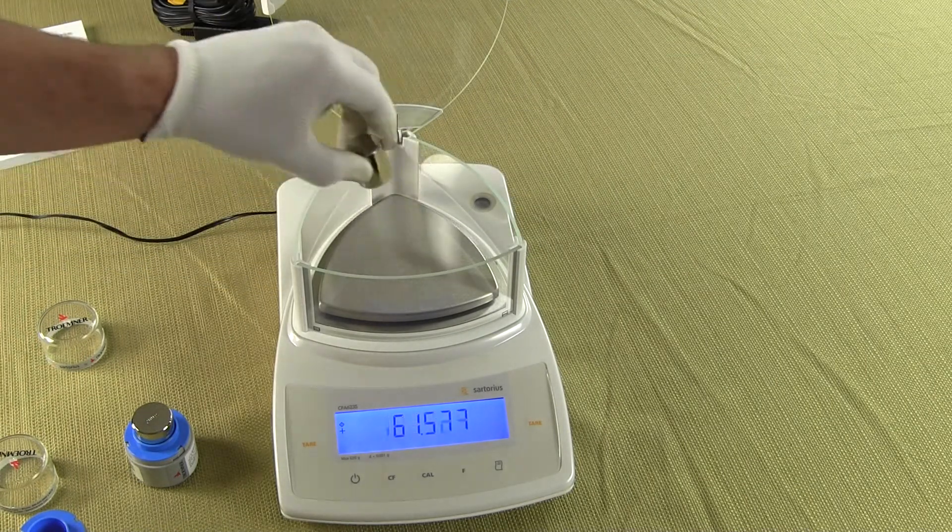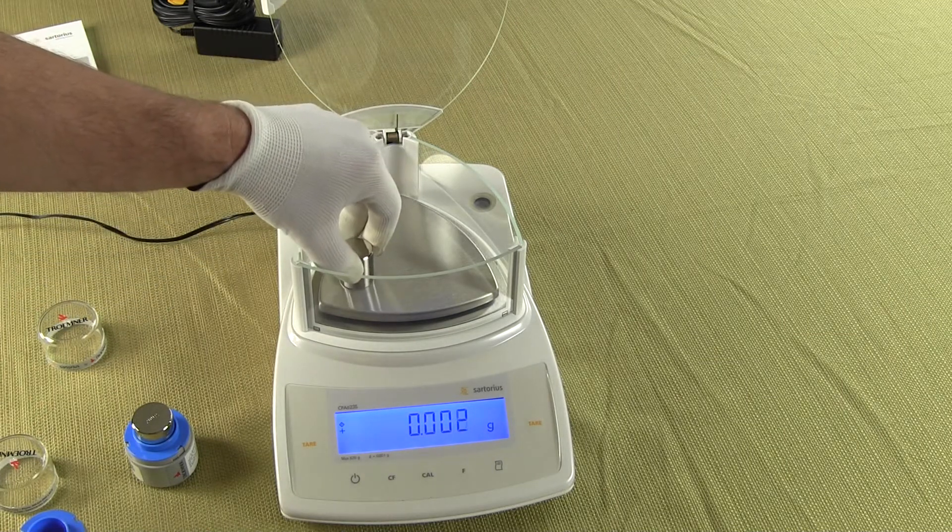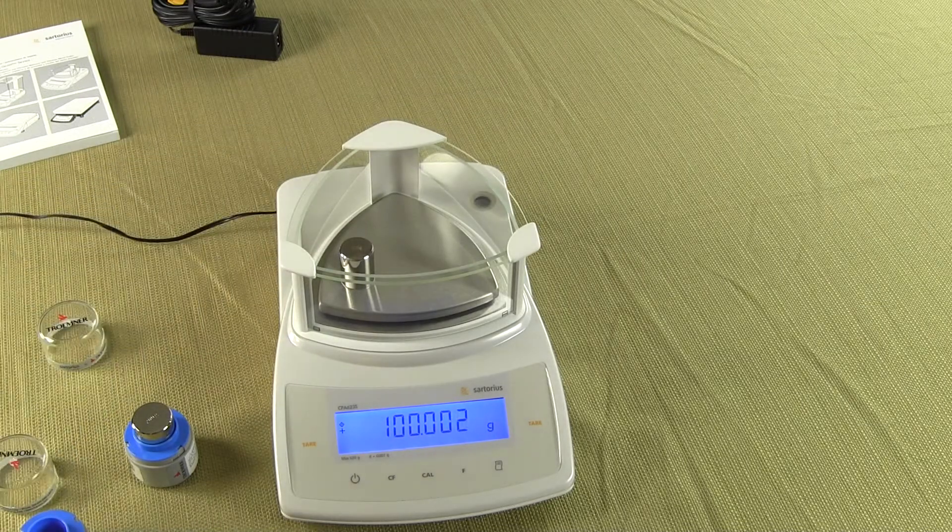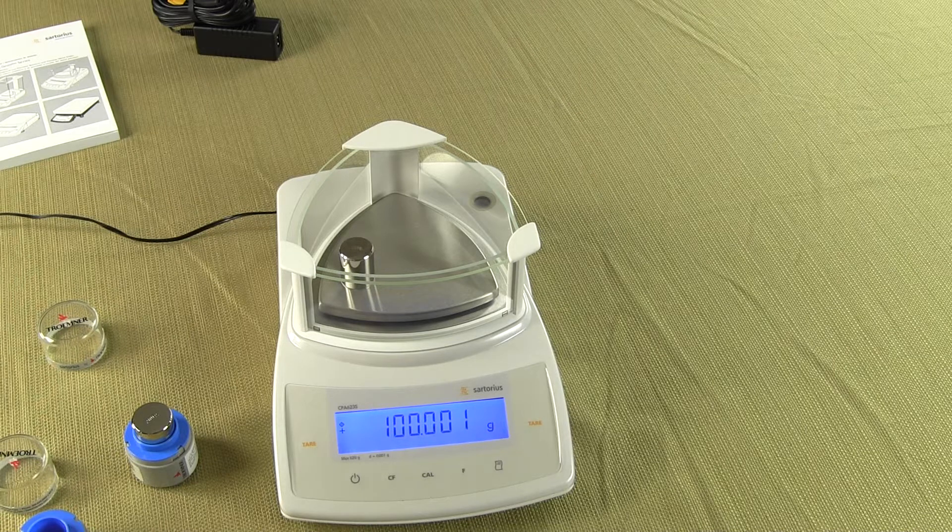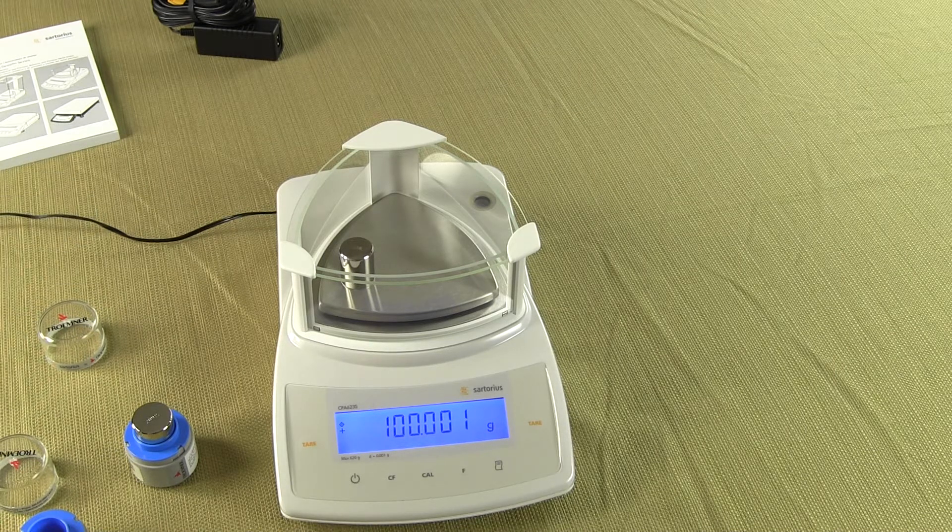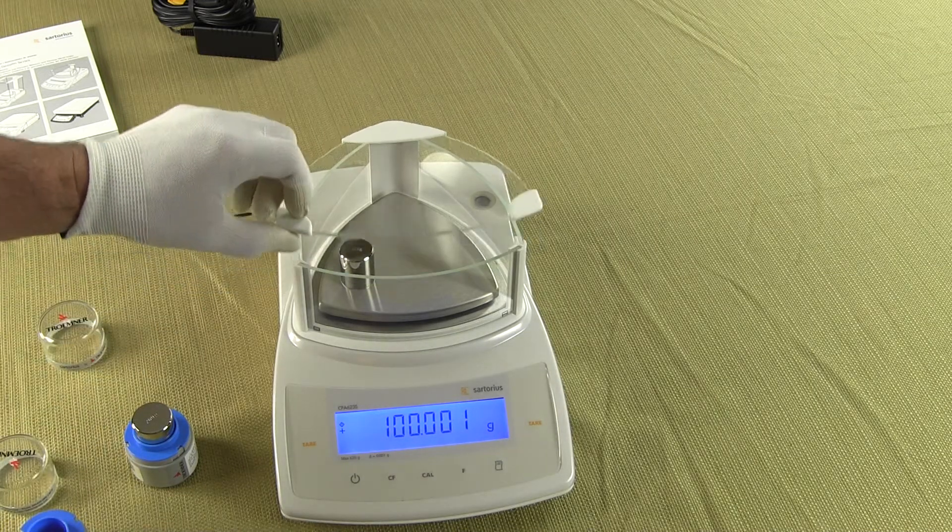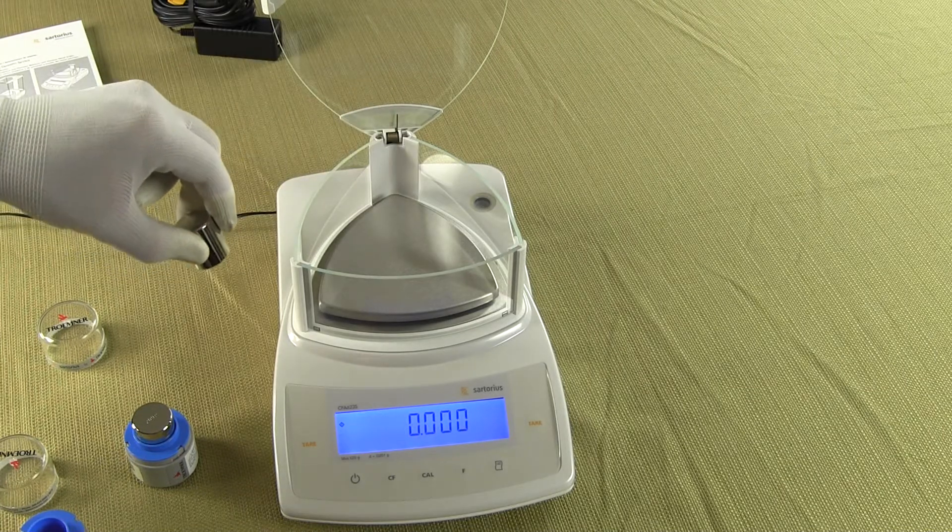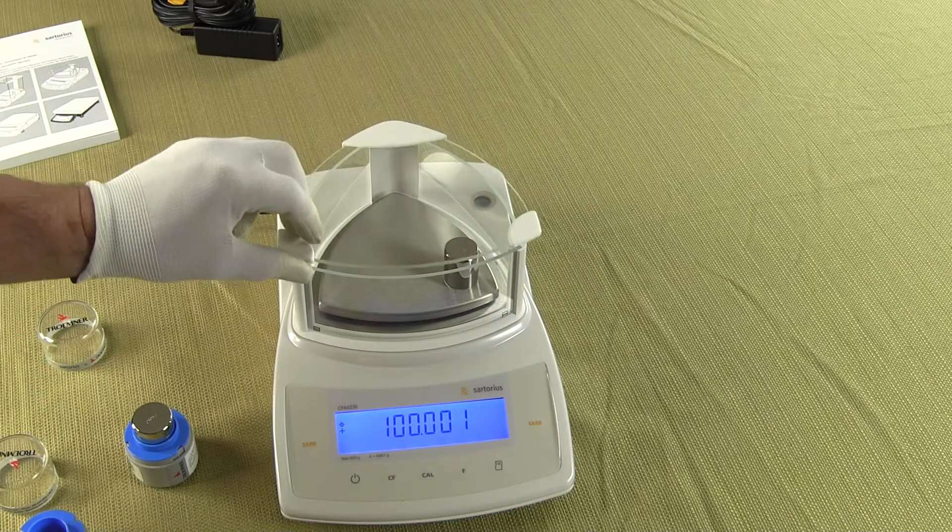And again the performance that you'll get out of a Sartorius is unmatchable. I mean Sartorius has the Guinness Book of World's Record for the most accurate balance in the world. They've been building balances for 140 years. So when someone says buy my balance it's the best, ask them, have they broken the Guinness Book of World's Record and if not why?